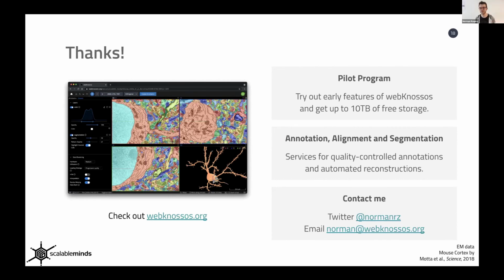Yeah, absolutely. So I mean, it works with 3D data sets of all kinds. It works well for serial block face or FIB-SEM. We also have X-ray data in there. We also can support fluorescence data sets with multiple channels, and you can overlay them. You can also overlay fluorescence layers on top of EM, and so it's quite versatile in what kind of data sets it can handle. Maybe I wonder if Sabrina's thinking about cryo-EM, like for structures. I'm not sure, but yeah, I mean, it's certainly something we can look into.